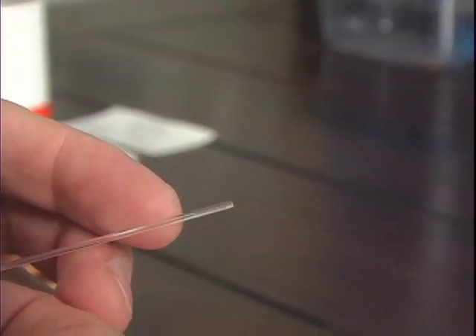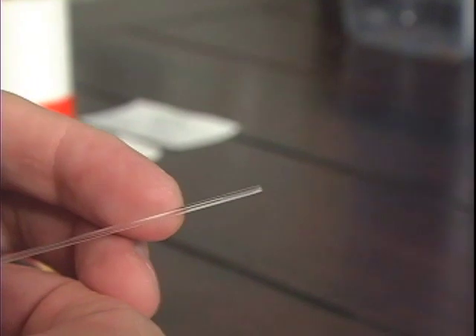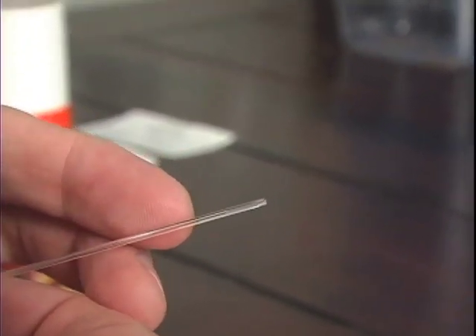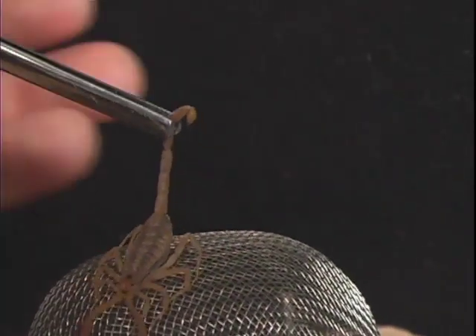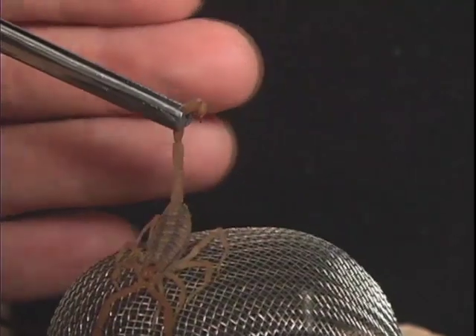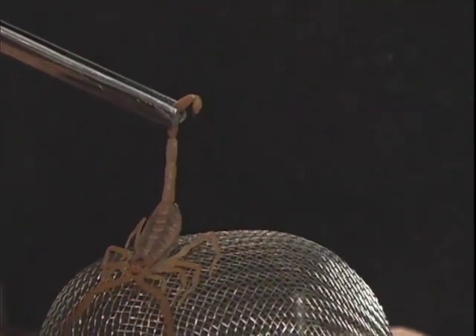It may only take a single sting from a bark scorpion to cause neurotoxic symptoms in a human. To do research on scorpion venom, we needed as much venom as possible to successfully perform experiments. That's why I had to milk more than 100 scorpions more than once to get enough venom for the study.